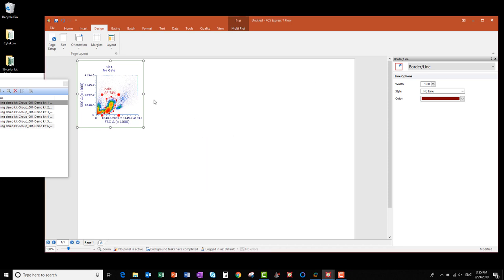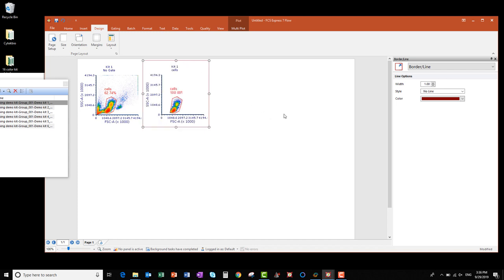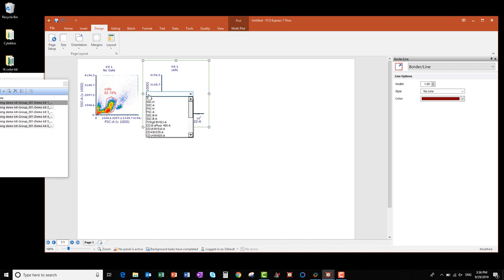To create a new plot displaying only the events in the Cells gate, I can click and drag the Cells gate to an empty space in the layout. I want my next plot to be CD3 versus CD19, so I change the X-axis by right-clicking on it and searching for CD3 AlexaFluor 532. Next, I'll change the Y-axis to CD19 BV510.